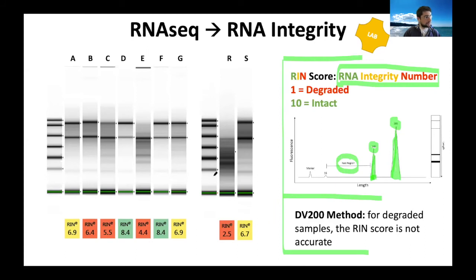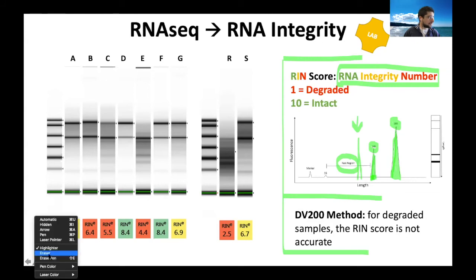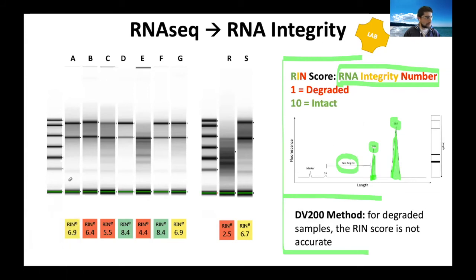Messenger RNAs are minimal in terms of percentage of total RNA, like 5%, and they also have different sizes. So you will not be able to see a peak of messenger RNA. You will not be able to say, oh, this is messenger RNA. That's not possible, they all have different sizes. That's why you don't see anything. You might see a little smear like this, but it's very difficult to distinguish it from the background.